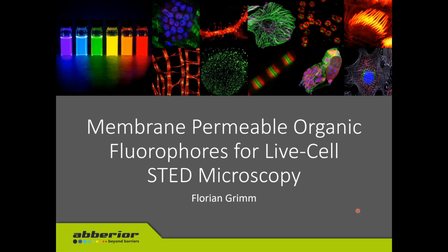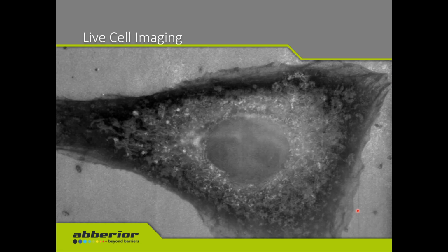The reason why we need fluorescent molecules in microscopy, no matter if organic dyes or fluorescent proteins, is that if you look through our microscope under bright field conditions, what we see is kind of a shadow of our cell and then probably also the nucleus, but we cannot really distinguish other proteins or structures or even organelles in our cell.